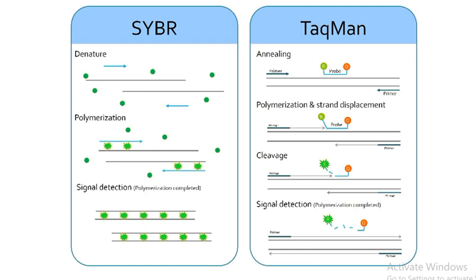It takes around 2 days to do it, and we do not know where exactly we went wrong. So each time we have to tackle the problem with the solution we used, concentration we used, all those things. So to reduce those kinds of problems, we took real-time PCR. What exactly real-time PCR does is it shows how exactly the process happens.